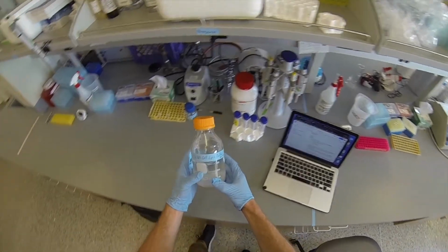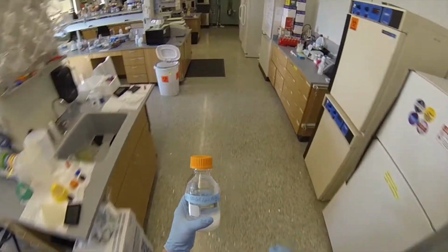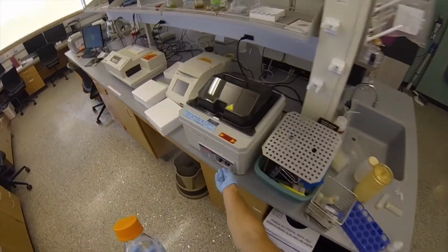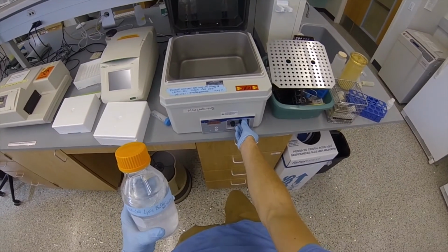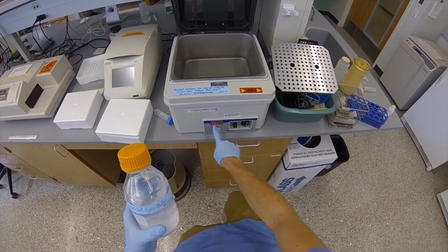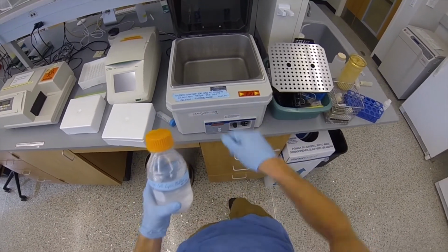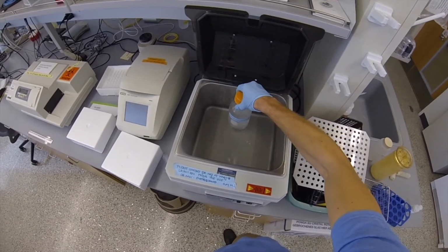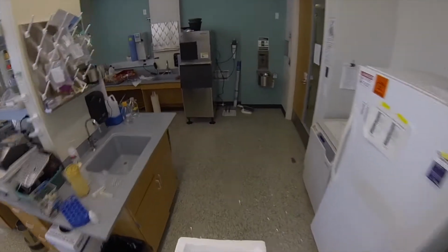Once everything is clean, you're going to grab the 1% SDS cell lysis buffer and bring it over to the hot water bath. You'll then set the hot water bath to 65 degrees Celsius. On your way back to the lab bench, grab a cooler and fill it with ice.